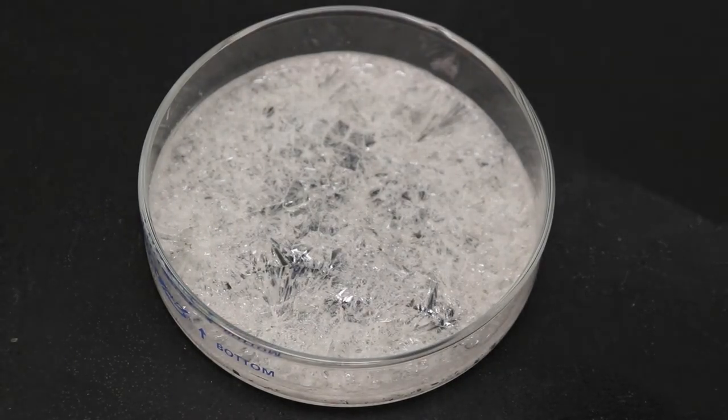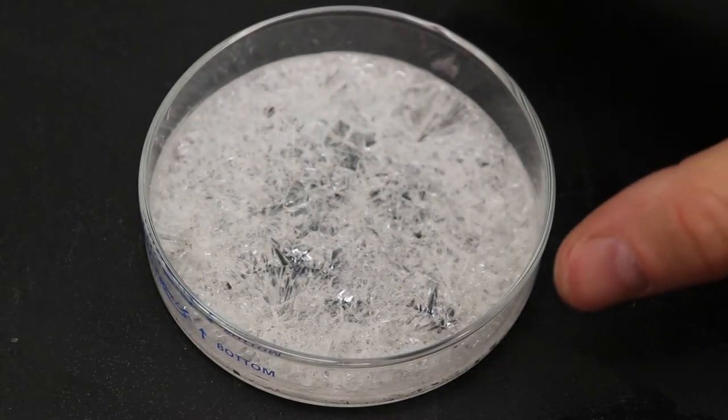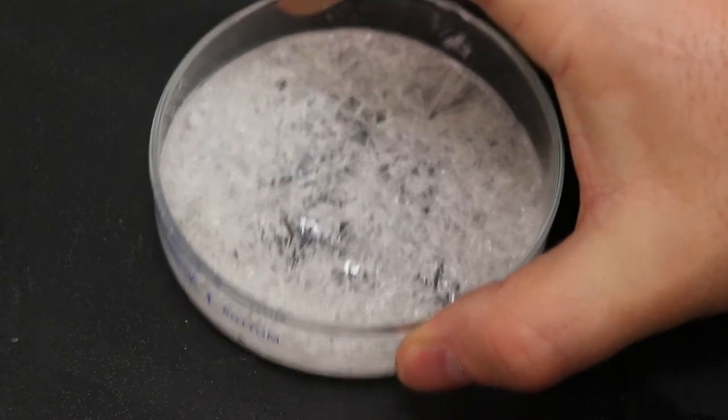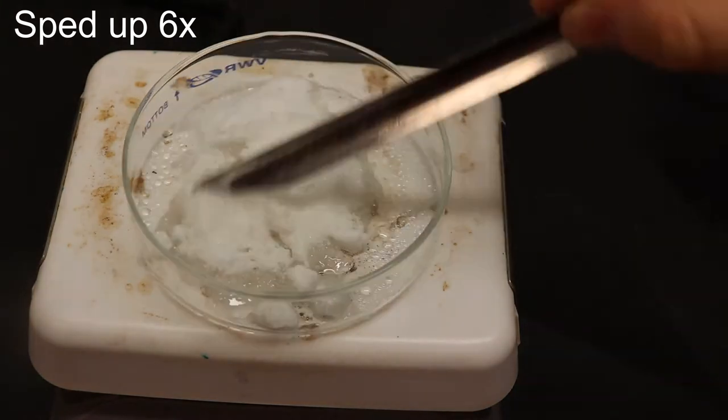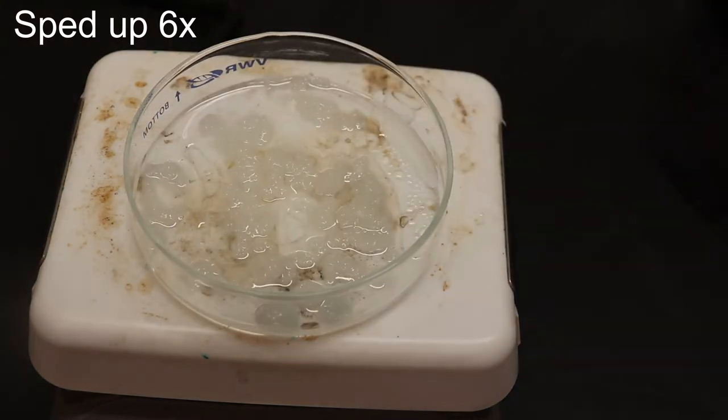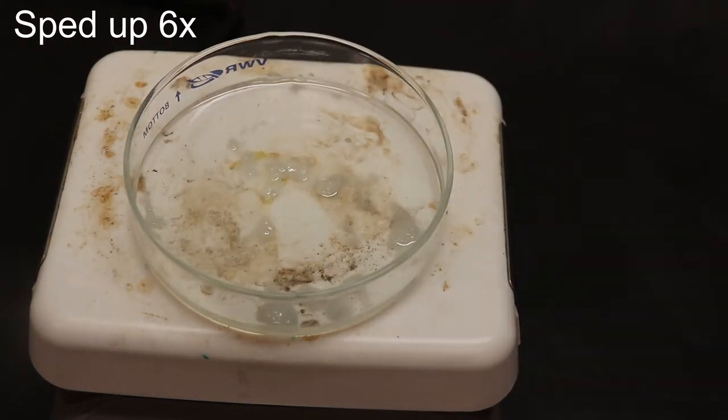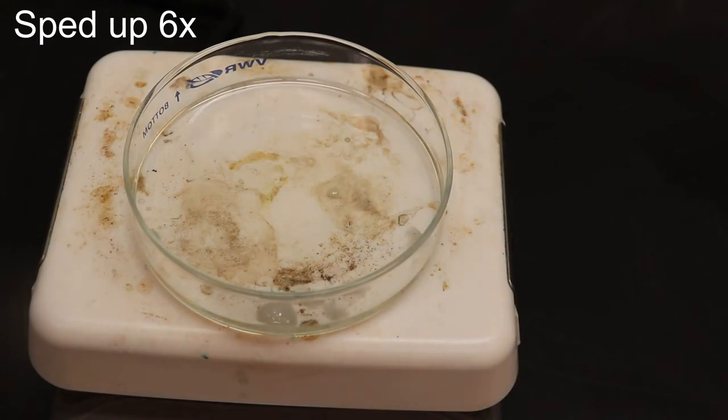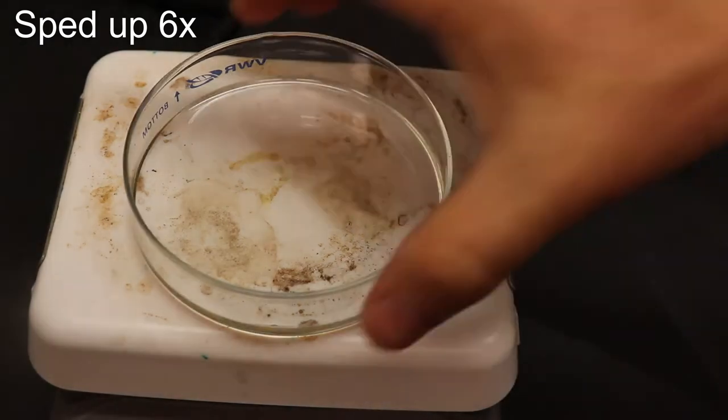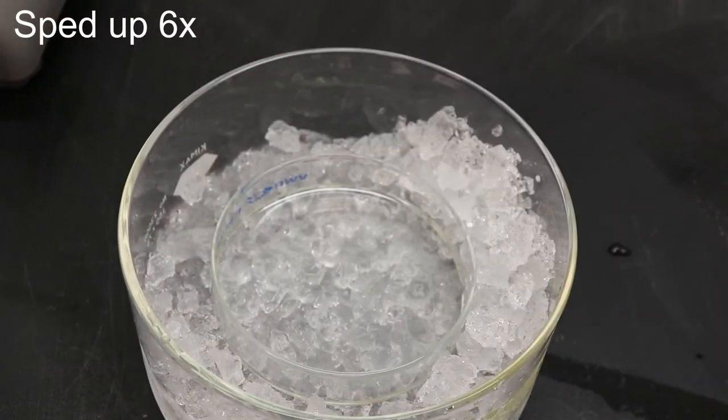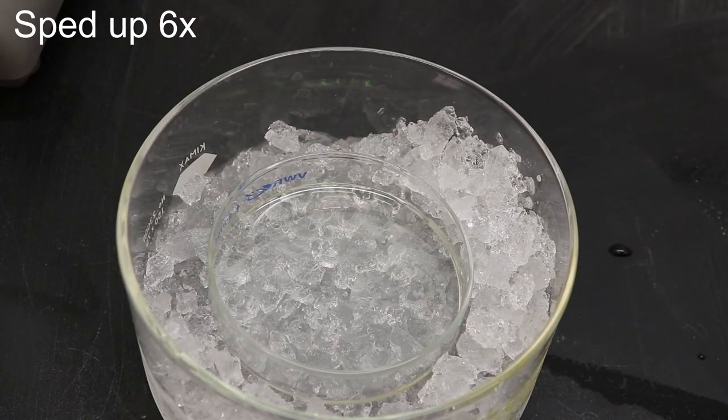All right, so it's almost completely done crystallizing now. I'm going to set this aside and start on the next one. And we're back up to six times speed again. This time it melted much more quickly because the plate and the petri dish were already hot. And then we'll stick it back in the ice bath.